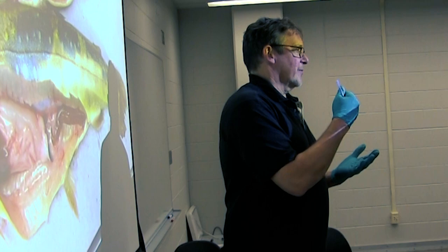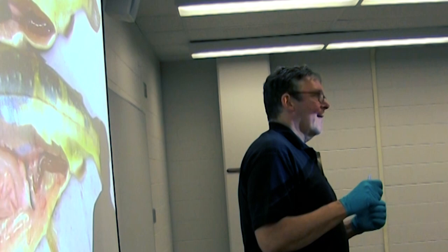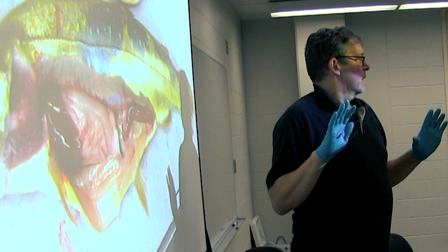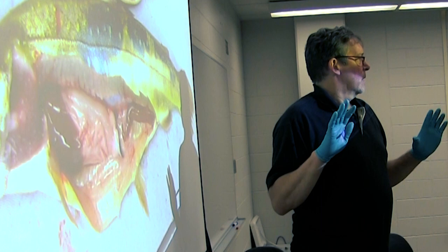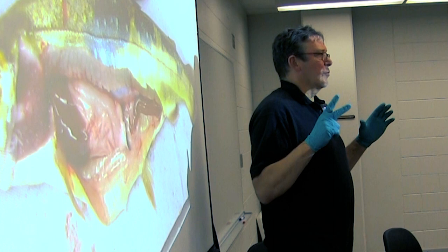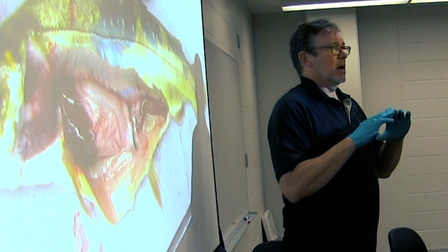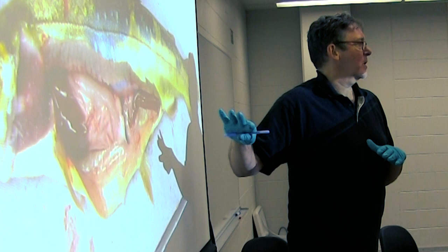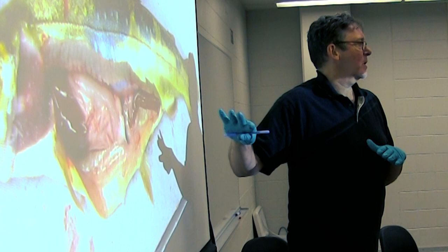There's a scale for measuring the fat — we tend to talk about whether there's zero fat, zero to 25% of the pyloric ceca covered, 25 to 50%, and so on up to 75 to 100%. I'm seeing a lot of nodding — the pyloric ceca has some fat on it and there are fat deposits. What does that tell us about the group? It says the group is in general getting a similar plane of nutrition. If you pick out 10 to 20 fish from a population, you'll have some with no fat and some with a lot — what does that tell you?